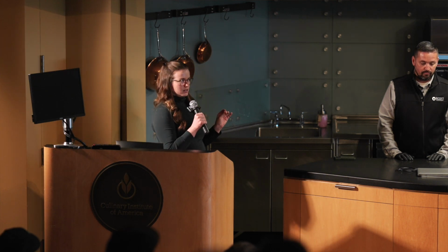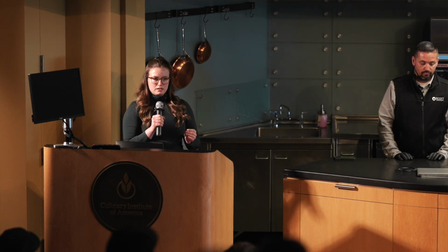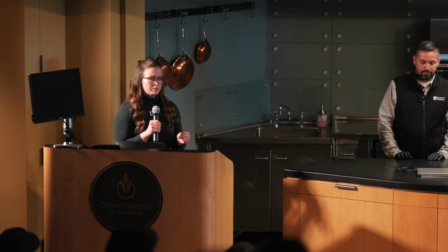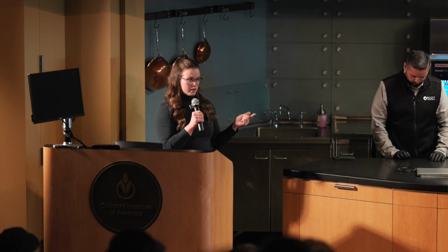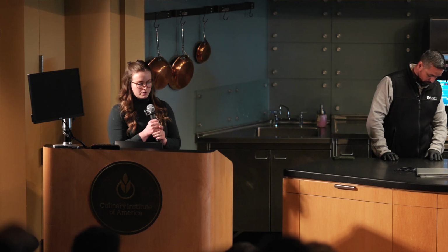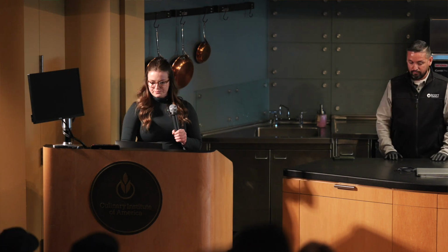setup and methodology. That being said, if you yourself are not giving a filterability test or conducting the filterability test, don't worry, there's something in here for you. Just knowing the parameters of your test setup and the values that you're being given can really help you figure out what you can extrapolate from them and what you can't extrapolate from them. So yeah, we'll get started.